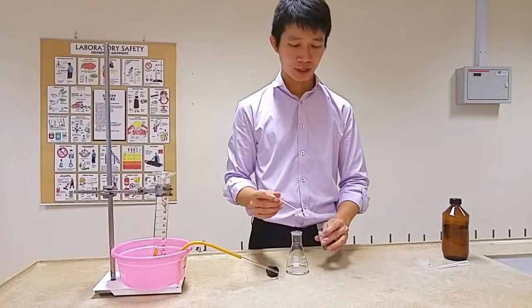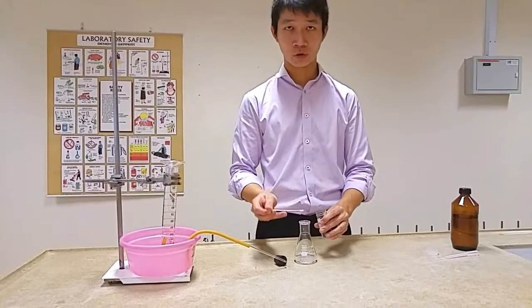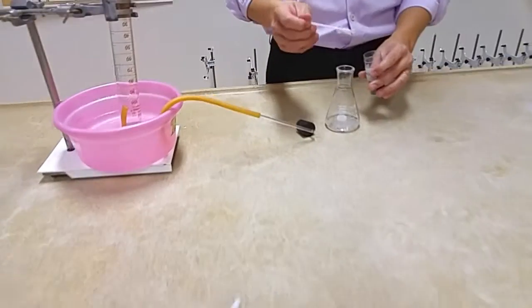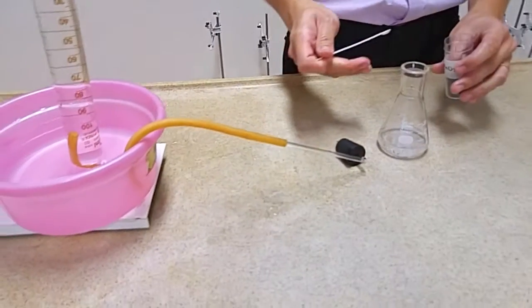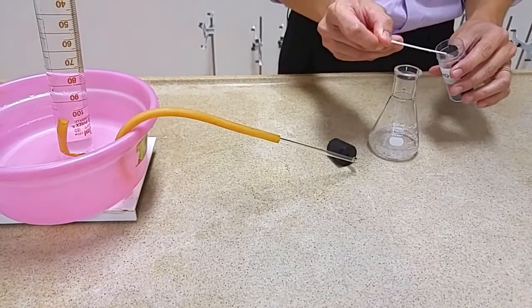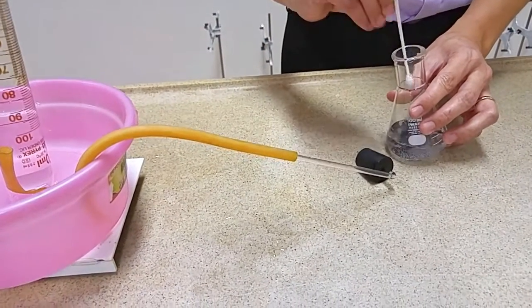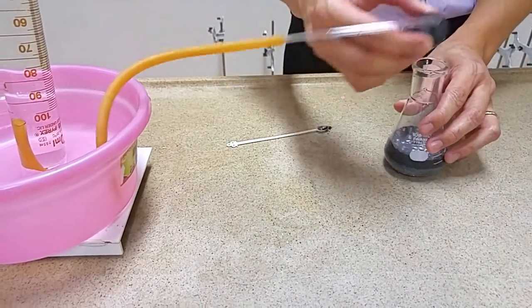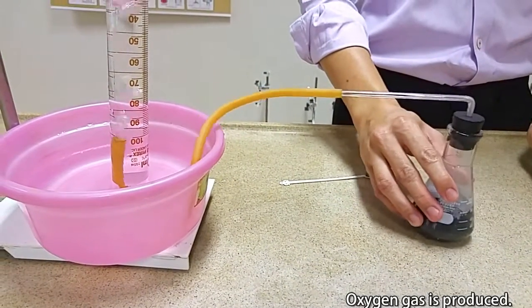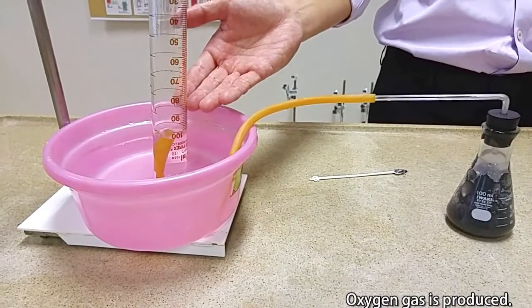Now add in the manganese dioxide catalyst into the hydrogen peroxide. You can do this a few times such that your experimental results are as accurate as possible. Swirl gently to ensure homogeneous mixing, and you can see the gas bubbles being produced in the measuring cylinder.